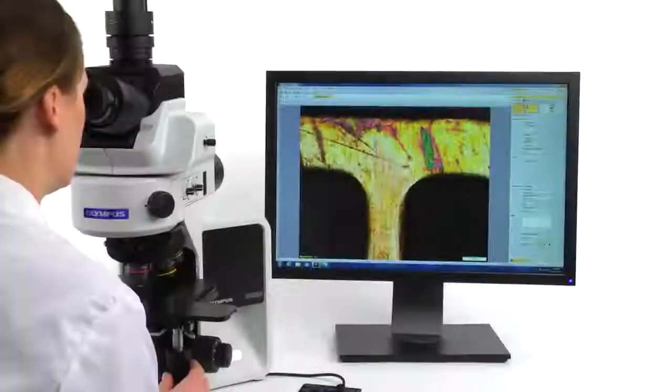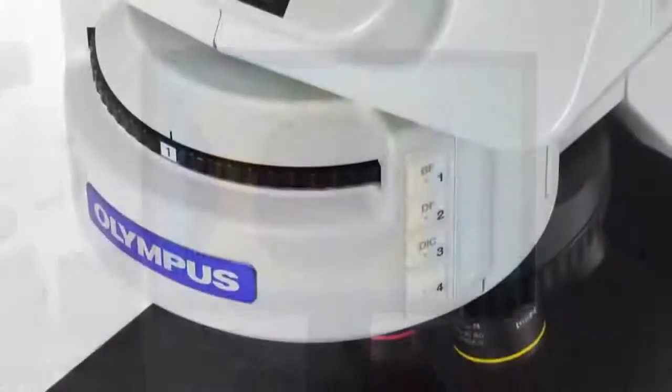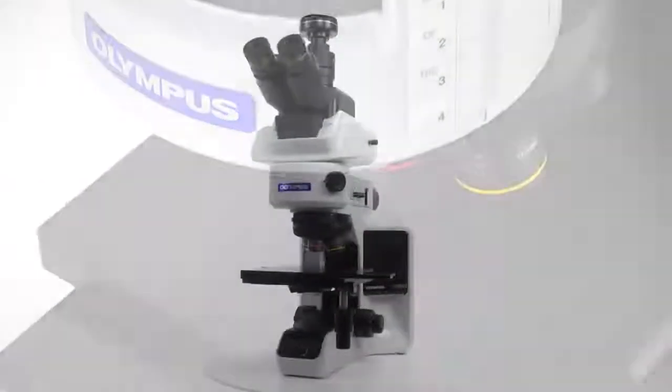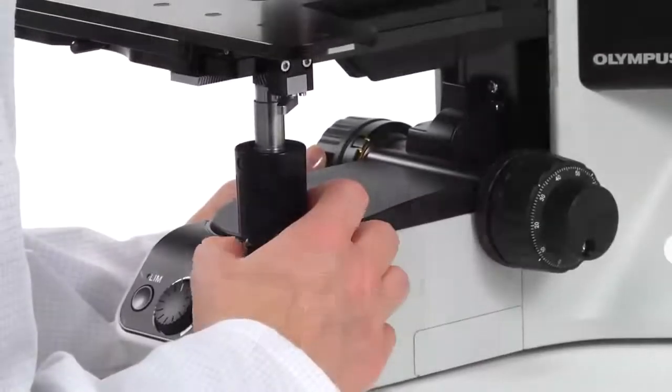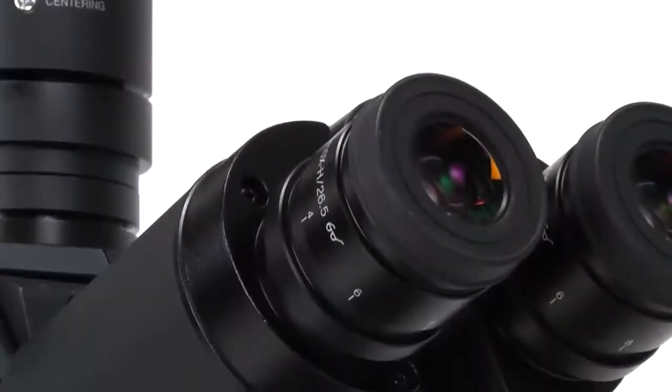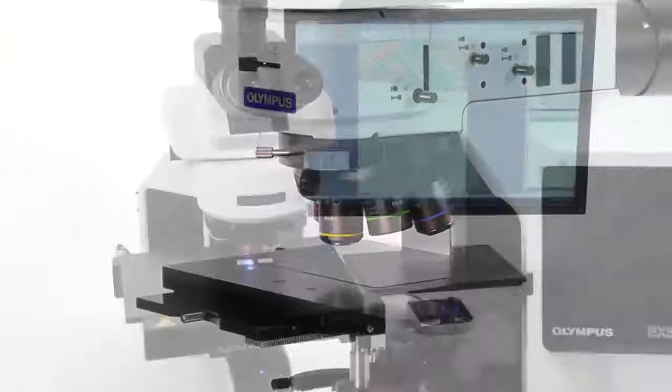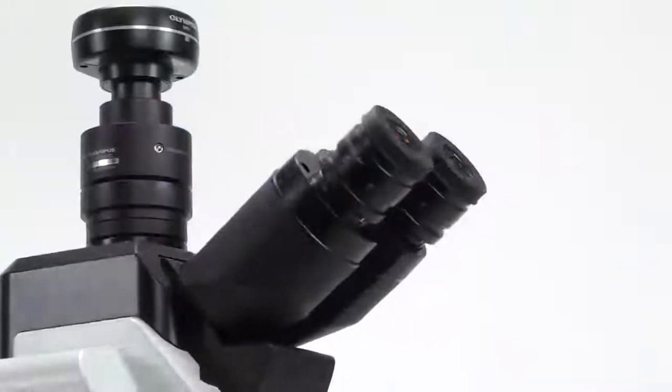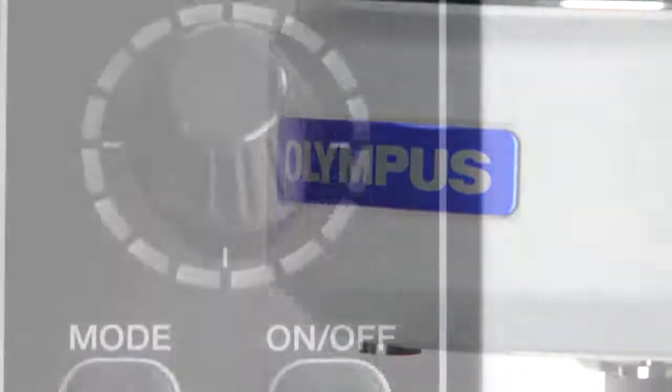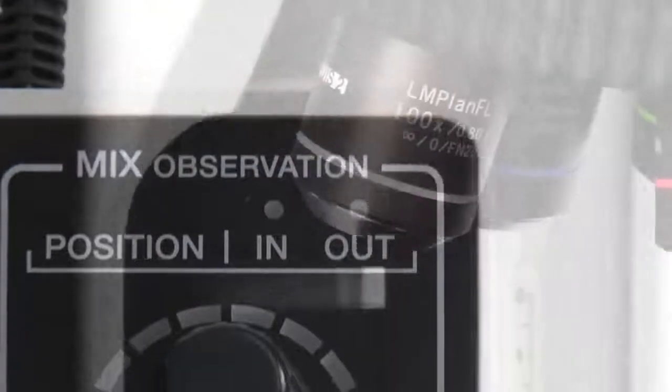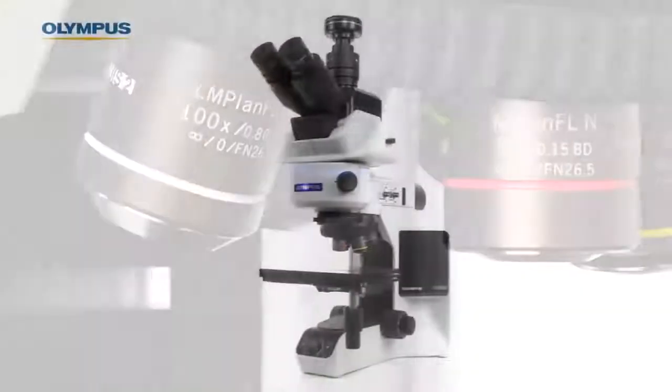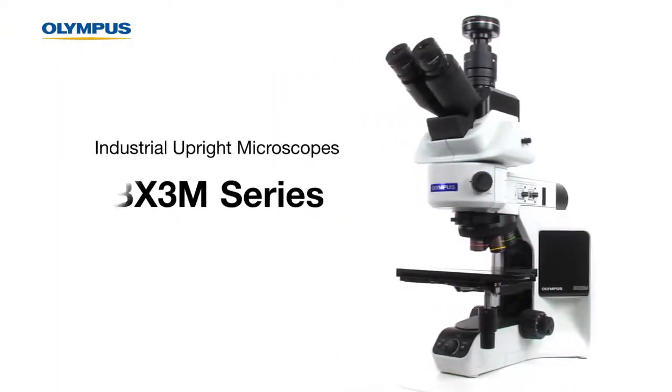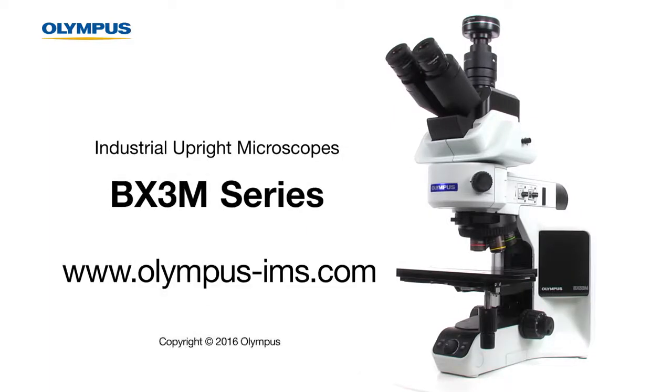For more than 90 years, Olympus has been a leader in microscope design. Our microscopes are constructed with the user in mind and feature an ergonomic design, advanced optics, industry-leading modularity, and powerful software. The BX3M's strong focus on intuitive imaging and functionality reflects our commitment to creating innovative microscopy solutions to support the needs of our customers. For more information, contact your local representative or visit our website at www.olympus-ims.com.